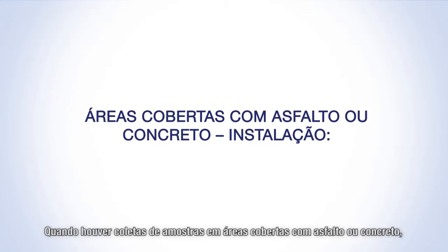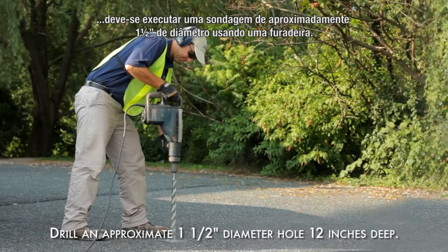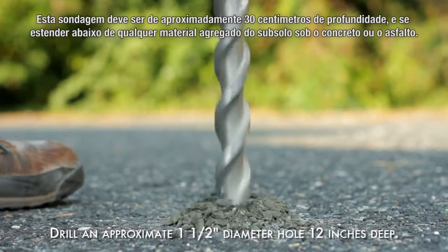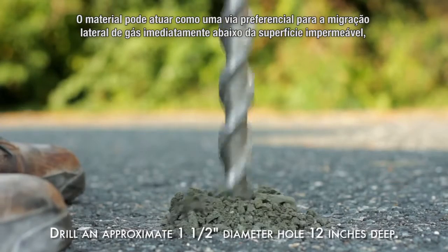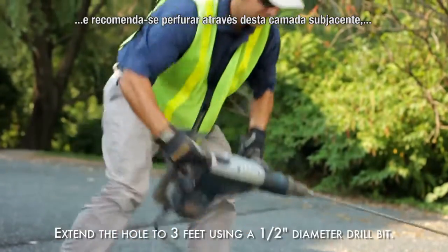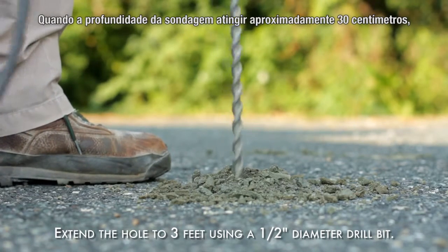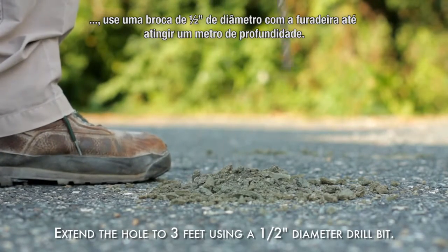When sampling in asphalt or concrete covered areas, drill an approximately one and a half inch diameter hole through the surfacing using a rotary hammer drill. This hole should be approximately 12 inches deep and extend below any subsurface aggregate material beneath the concrete or asphalt. The aggregate can act as a preferential pathway for lateral gas migration immediately beneath the impervious surfacing, and it is recommended to sleeve the hole through this subgrade layer unless the objective is to identify sub-slab contamination regardless of the source location. When the approximately 12 inch deep hole has been completed, use a half inch diameter drill bit with a hammer drill to extend the hole to a three foot depth.